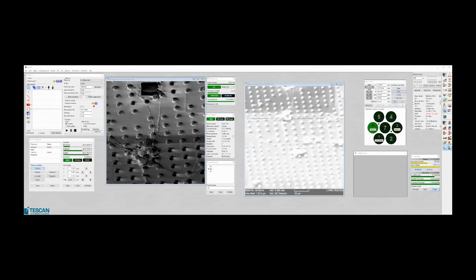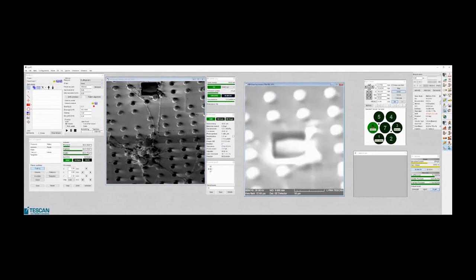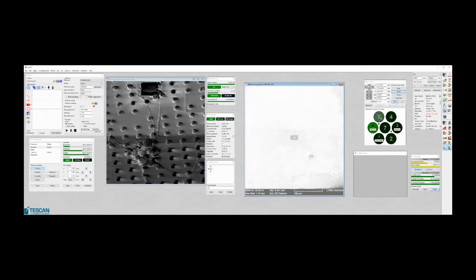Okay, is there? Okay, it was almost done. You see the line on the bottom? So it was almost cut there. So the next step would be to come with a tip, to fix it on a tip, to cut it from the side, and then you will pick up the lamella and you will fix it.